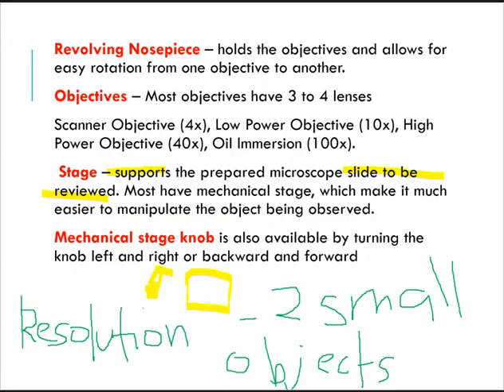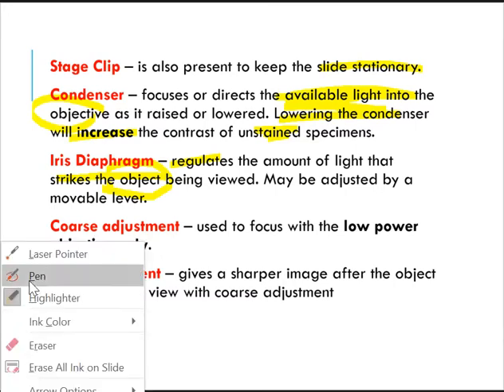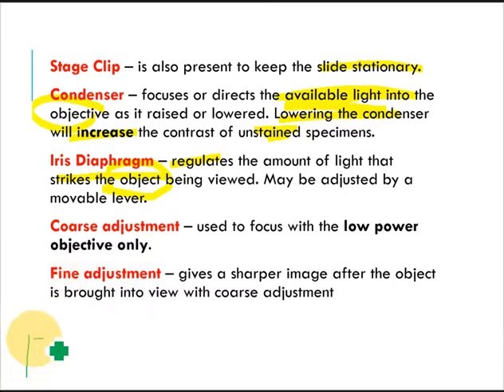Take note that the illumination system, as I said earlier, is provided by a light source in the base of your microscope. The light source is equipped with a rheostat.